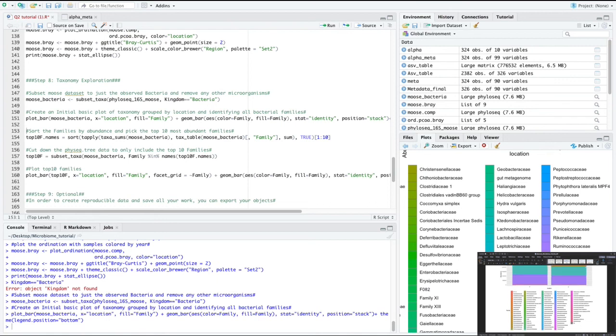Sometimes people actually do this at the beginning, so they can just say, okay, what am I working with here? What families are the most prominent in my bacterial data set? And this is where I was saying those genomes that have yet to be characterized, uncultured, like unidentified rumen bacterium, are just placeholder names until someone can go out there and characterize them.